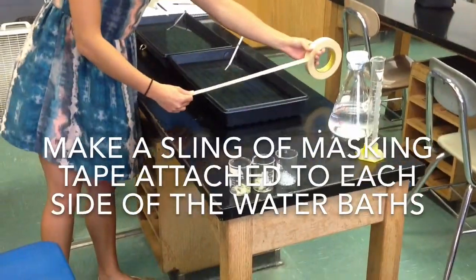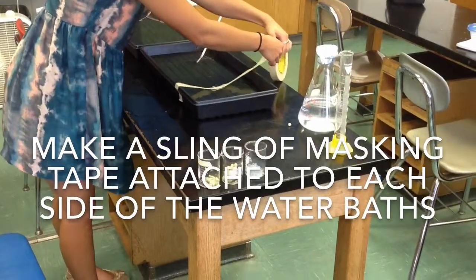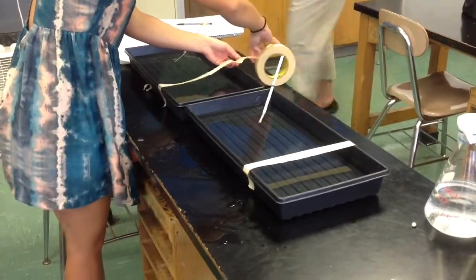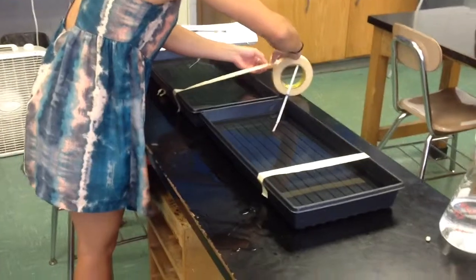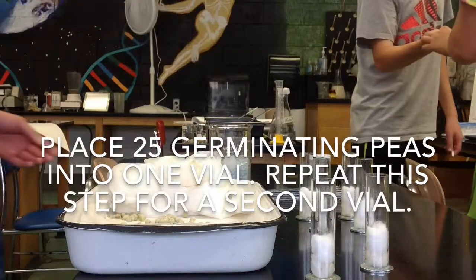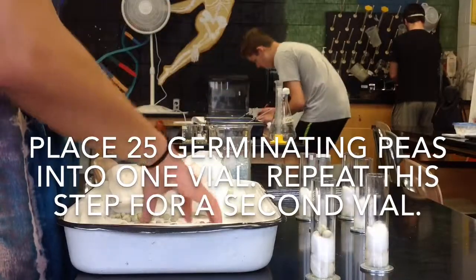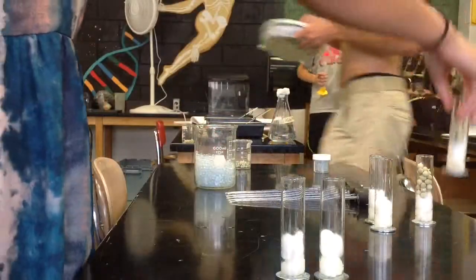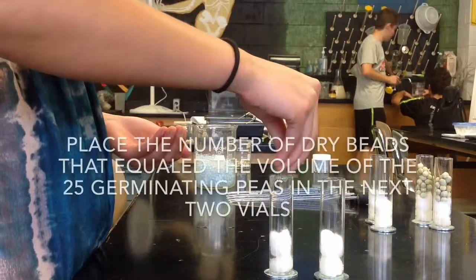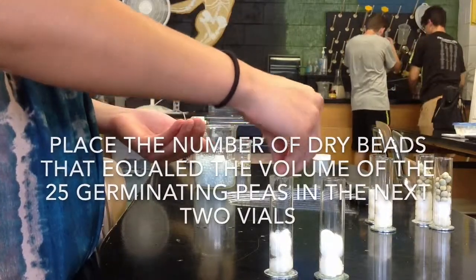11. Make a sling of masking tape attached to each side of the water baths. 12. Place 25 germinating peas into 1 vial. Repeat this step for a second vial. 13. Place the number of dry beads that equal the volume of the 25 germinating peas in the next 2 vials.